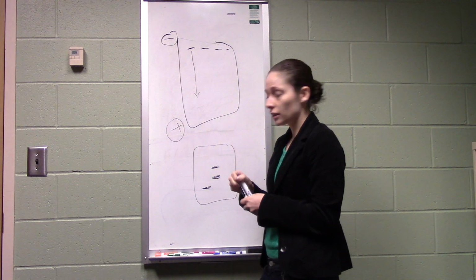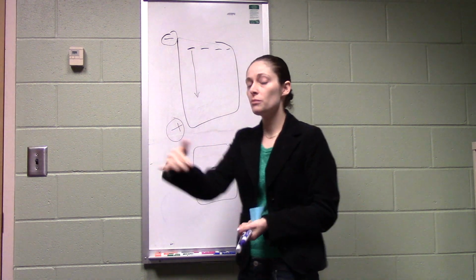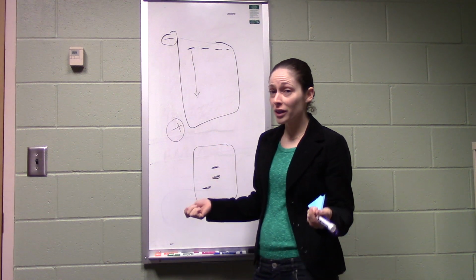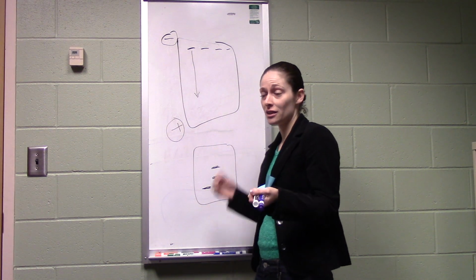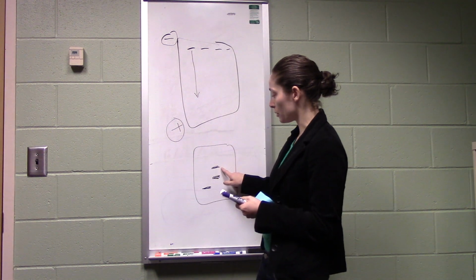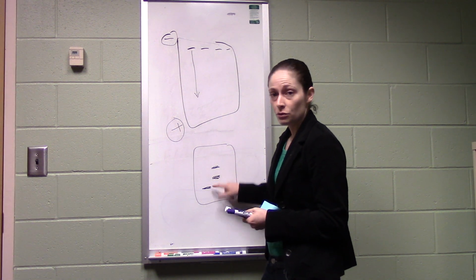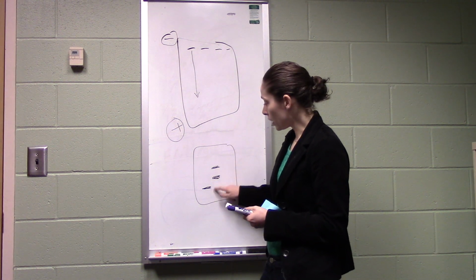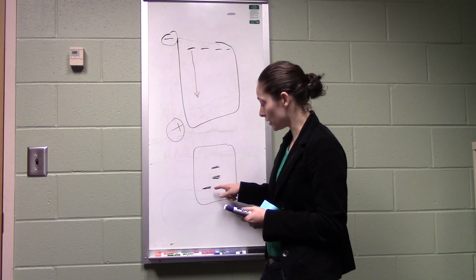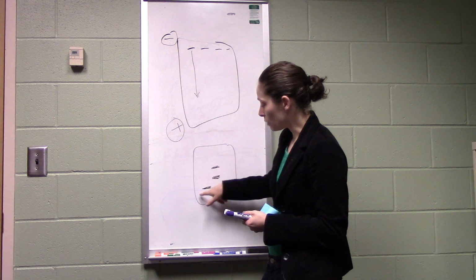Okay? Kind of like kids running through a forest. You've got a couple kids holding hands, they can move in between the trees really quickly and go really fast. If you have 20, 5-year-olds all holding hands trying to snake through the trees, they're going to get a little tangled and snagged and whatnot, so they go slower. Right? So that's why the short DNA runs faster. They all have the same charge to mass ratio, so that's not going to affect how fast they run. So the short guys go faster and will go towards the positive end.